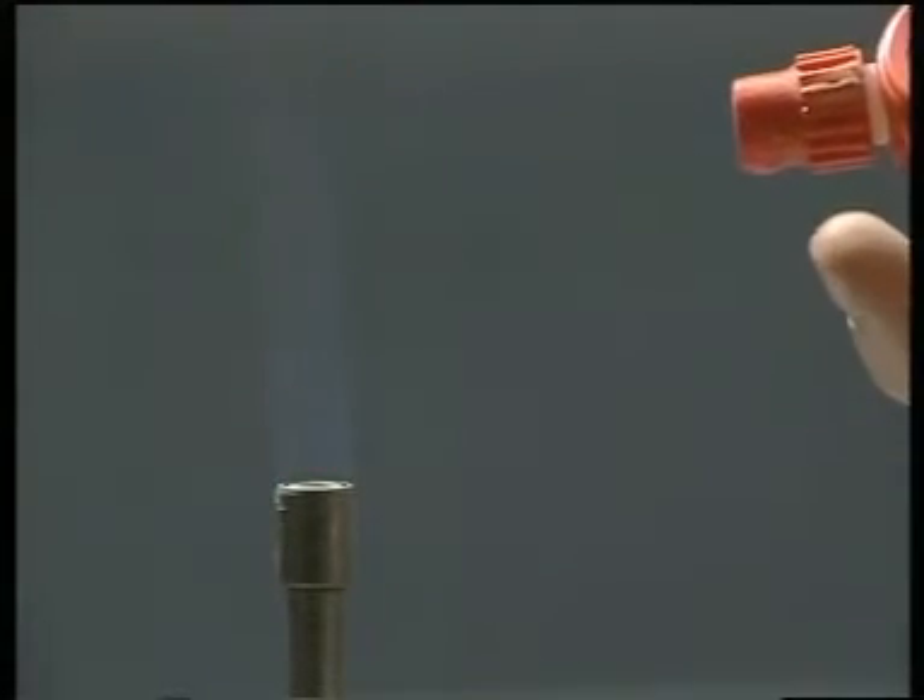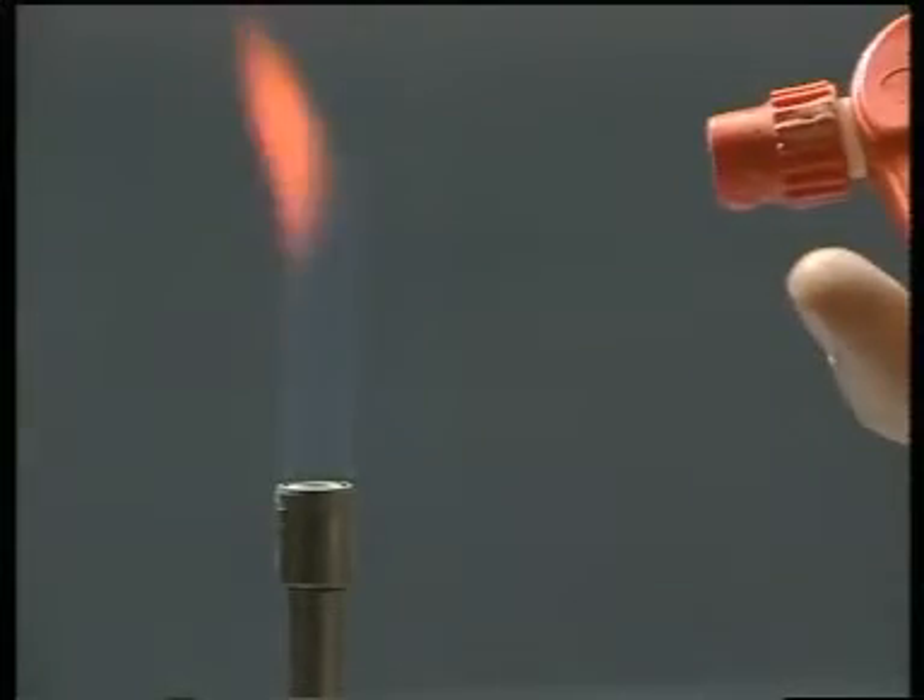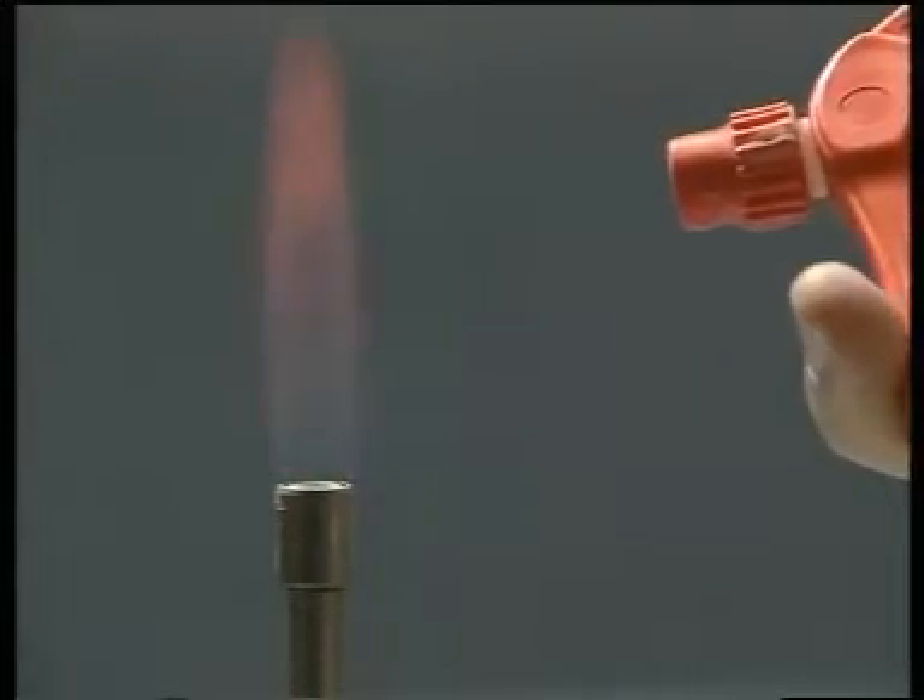Some metal ions will color a flame. This is used in flame photometry to measure trace concentrations, usually in water.